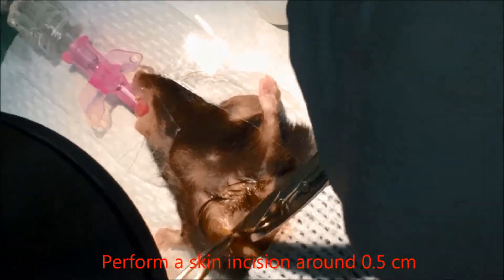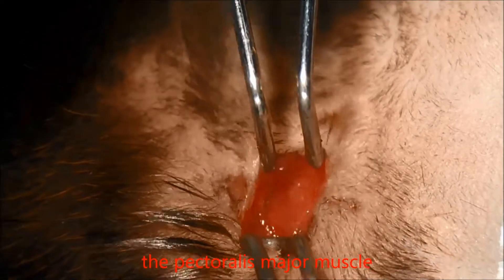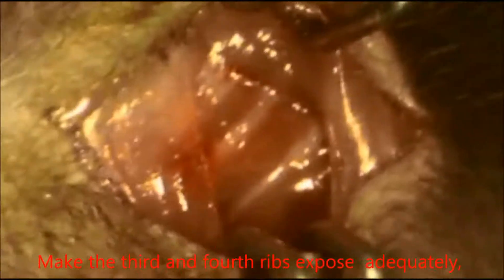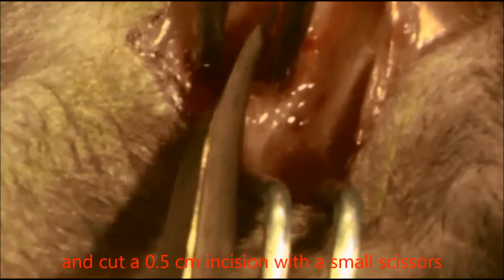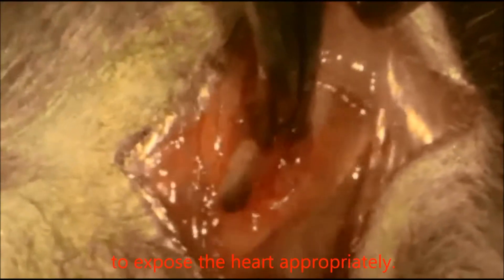Perform a skin incision around 0.5 cm in the middle of the line between the xiphoid and the left axilla. Separate the subcutaneous tissues, the pectoralis major muscle, and the pectoralis minor muscle using forceps to make the third and fourth ribs adequately exposed. Puncture through the intercostal muscle between these two ribs using the tip of small forceps, then pick up the intercostal muscle and cut a 0.5 cm incision with small scissors to open the thoracic cavity. Carefully remove the pericardium and use surgical hooks to expose the heart appropriately.